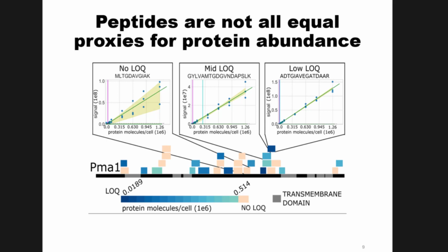And you'll notice there's maybe no rhyme or reason which peptides have a good limit of quantitation and which ones don't. A lot of these peptides show no change in signal when I've deliberately changed their quantity. So it's something I detected, but I certainly did not quantify in the sense of change in signal, change in quantity. Is the detection correlated with the size of the peptide?